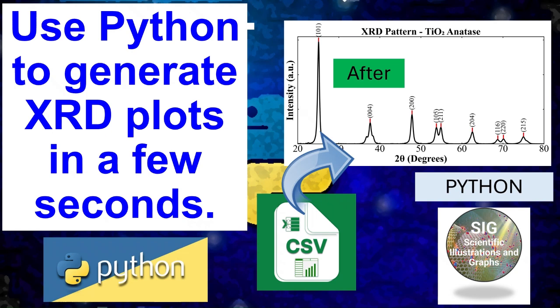Hello everyone. Today we are going to look at a Python script that can make your plotting of XRD data much easier. You can use this code to take your raw data file, for instance in CSV format, and turn that into a high quality graph that's ready for a presentation or a scientific publication, all in just a few seconds. The code even labels the peaks of the XRD for you.